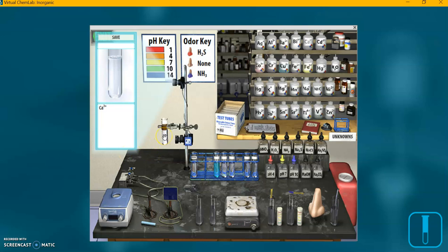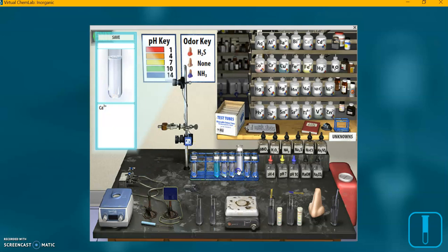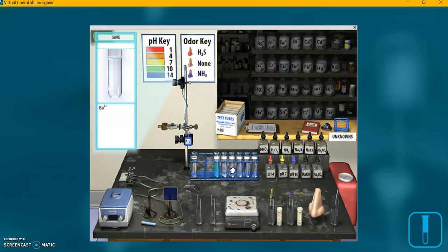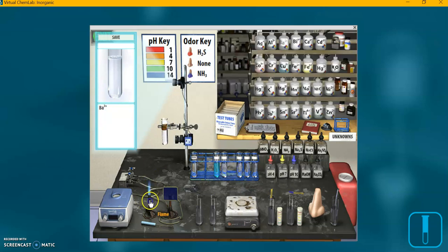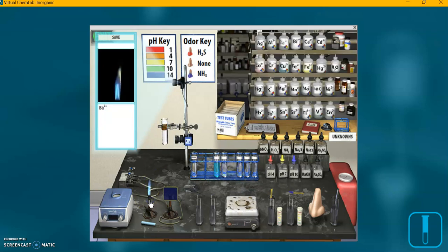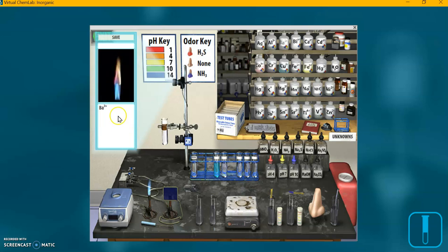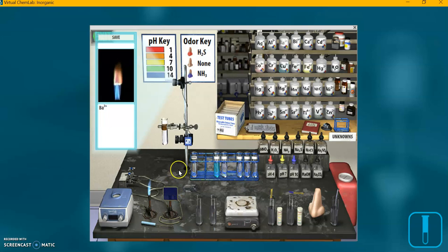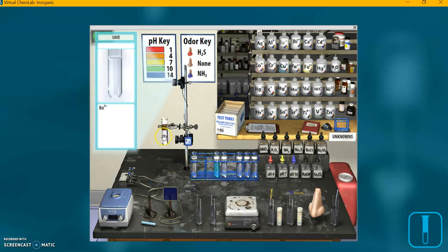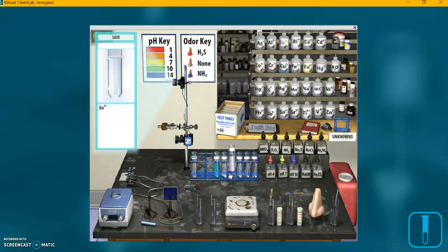Okay. So for the rest of them, it says not to use the cobalt glass plate in front of the flame. Just use the regular Bunsen burner flame. And that's the calcium. Let's try the barium. Now that one definitely looks different.